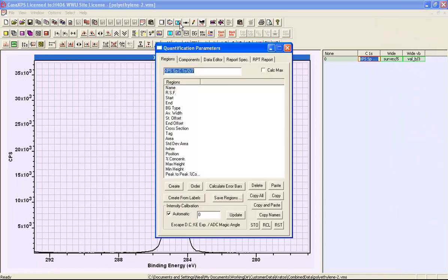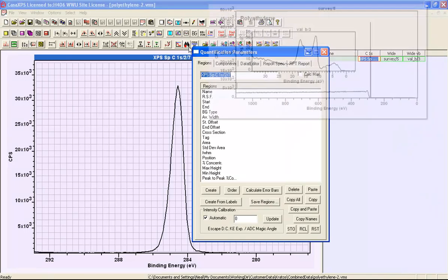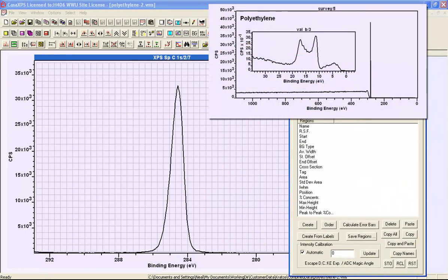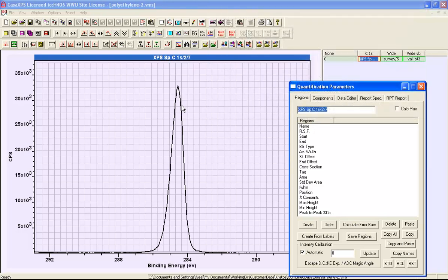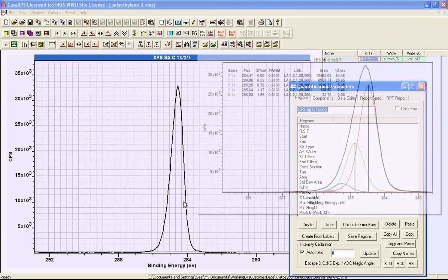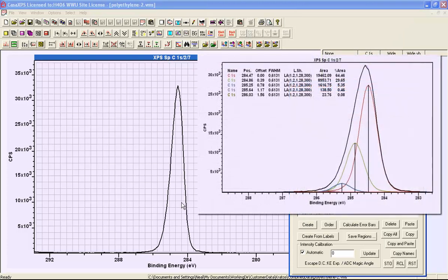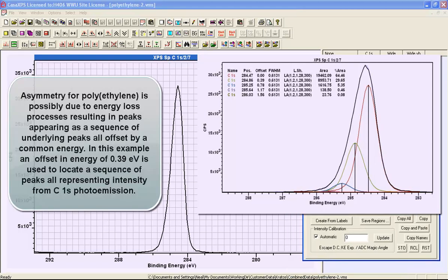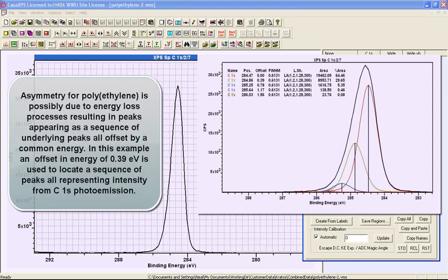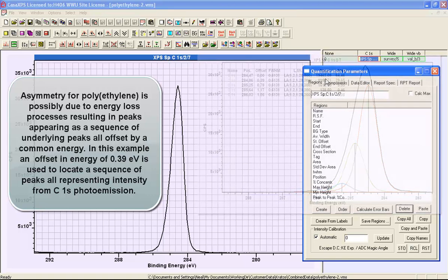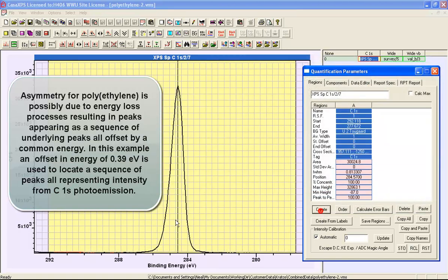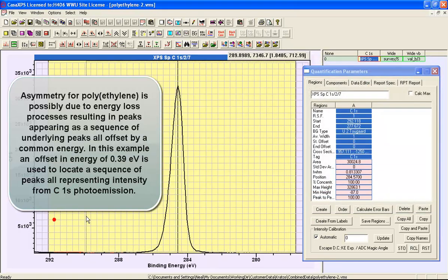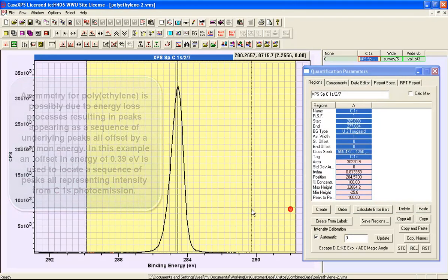Polyethylene is an example of a photo emission peak that has inherent asymmetry that is reproducible, and it is believed that the asymmetry is a result of a sequence of peaks that have all been offset by a common binding energy. Using the quantification parameters dialog window, we'll create a background to these data and then a sequence of component peaks.